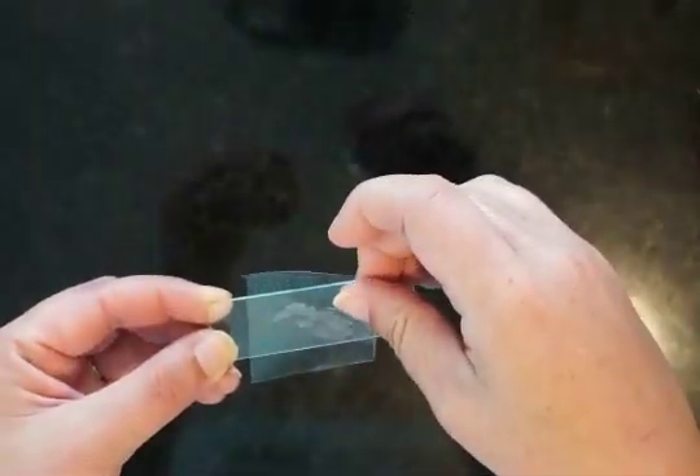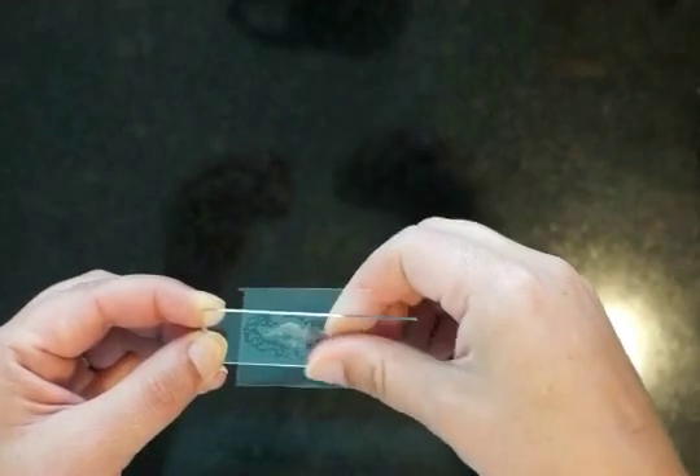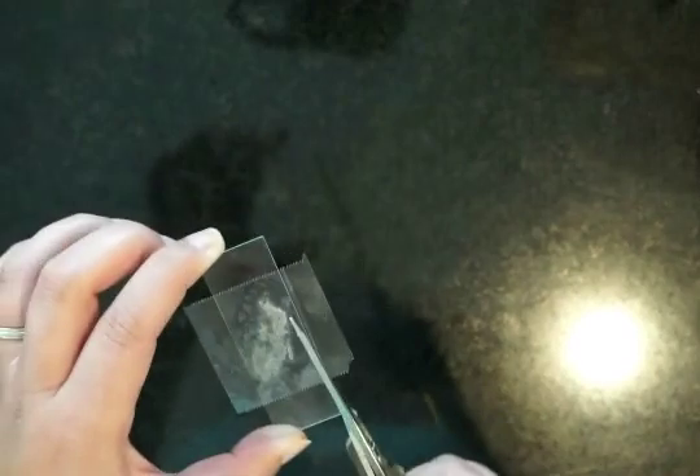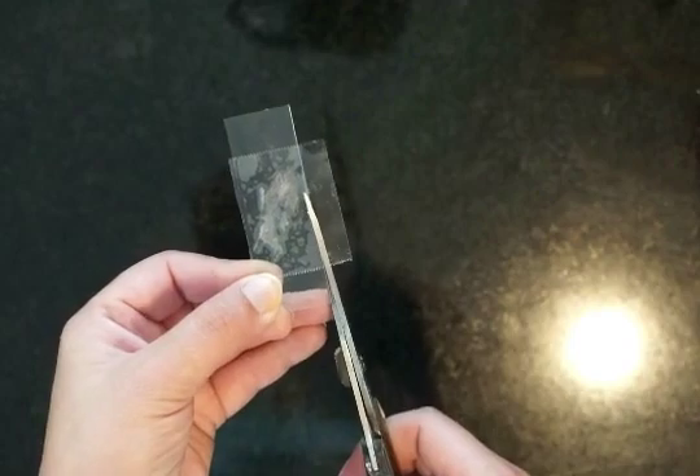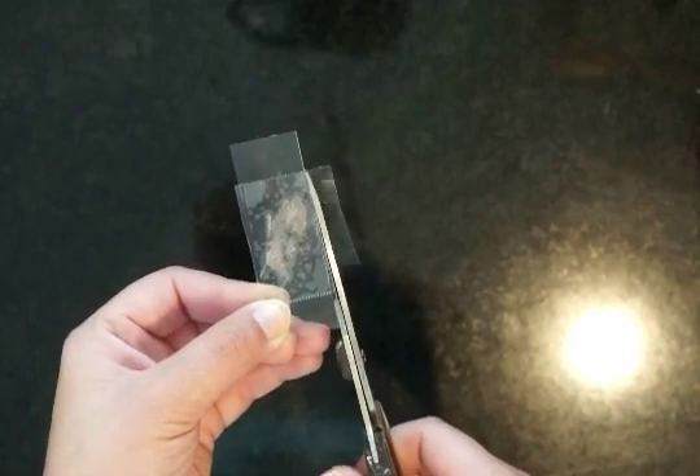And then you're going to take that clear nail polish that is now on your packing tape and stick it on your blank microscope slide. You can trim it a little bit on the edges, just so that it moves a little bit easier under the microscope. You don't have to trim it if you don't want to, but don't fold it back around or you'll have trouble looking through that many layers of tape on the microscope.